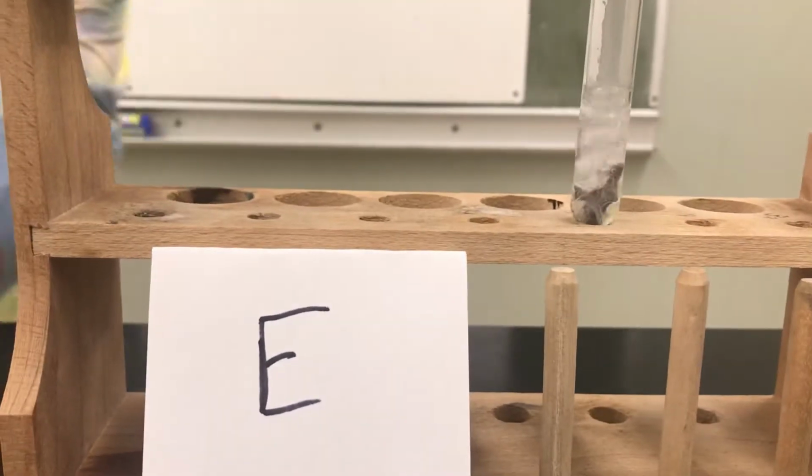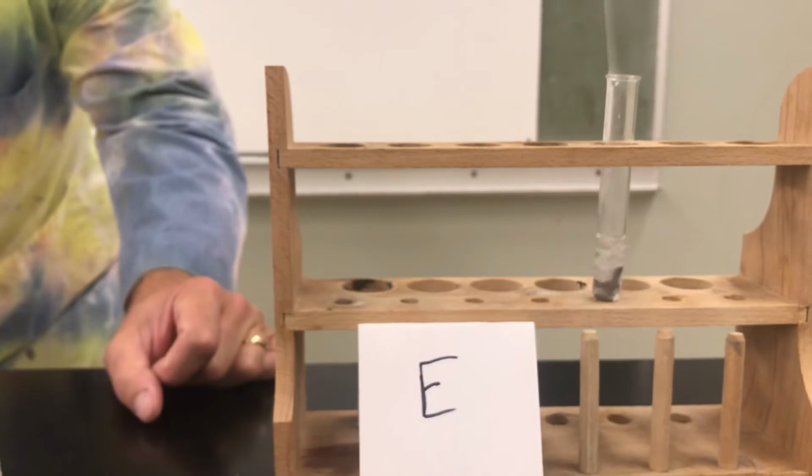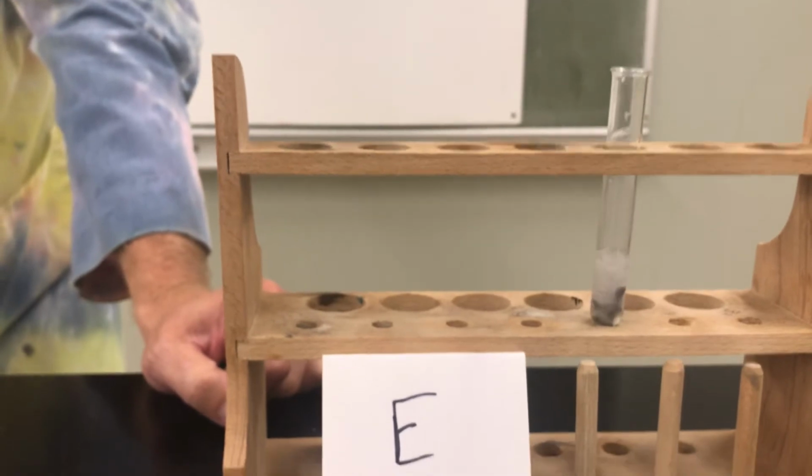Now, obviously, we see bubbles coming out. You can see some vapor coming out the top. There is a gas being formed. If I were to touch it, it would probably burn me. Very, very hot. So you see some obvious changes happening. Okay? If I try to smell it, it does have a definite odor to it. It's almost like an obnoxious odor, something you wouldn't want to smell very much.